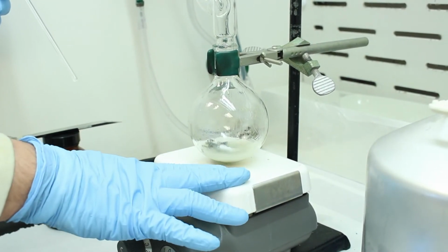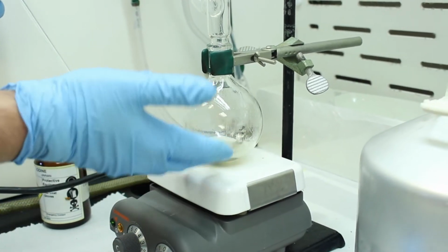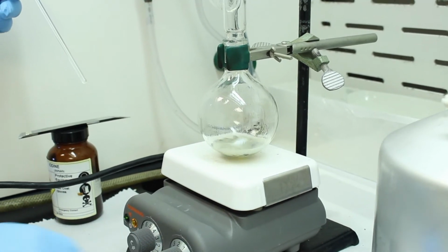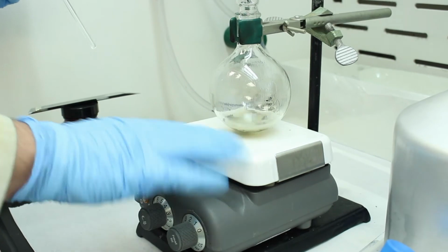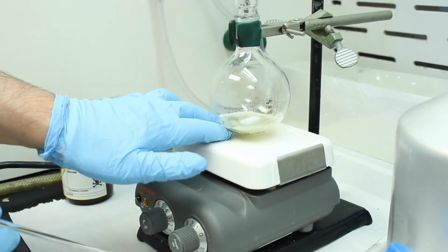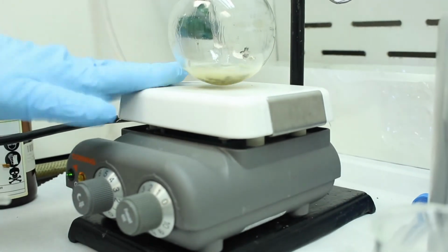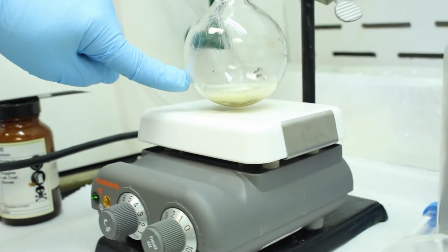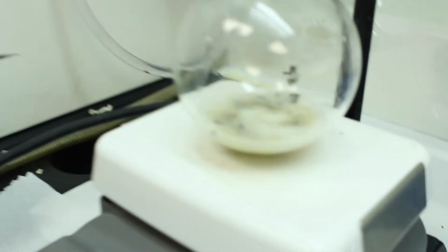And what we're going to do is we want to sustain this, bring it up to a reflux. Not really a real reflux, I mean ether boils at such a low temperature, so we just have to heat it so mildly. We'll set the hot plate to low, and just the hot air is enough to heat the flask. So the flask is not touching the hot plate. A little bit of a gap here. But that little bit of heat generated should be enough to keep this reacting. So you can even see it beginning to fizz here. So that's what the initiation looks like. You can see it fizzing.